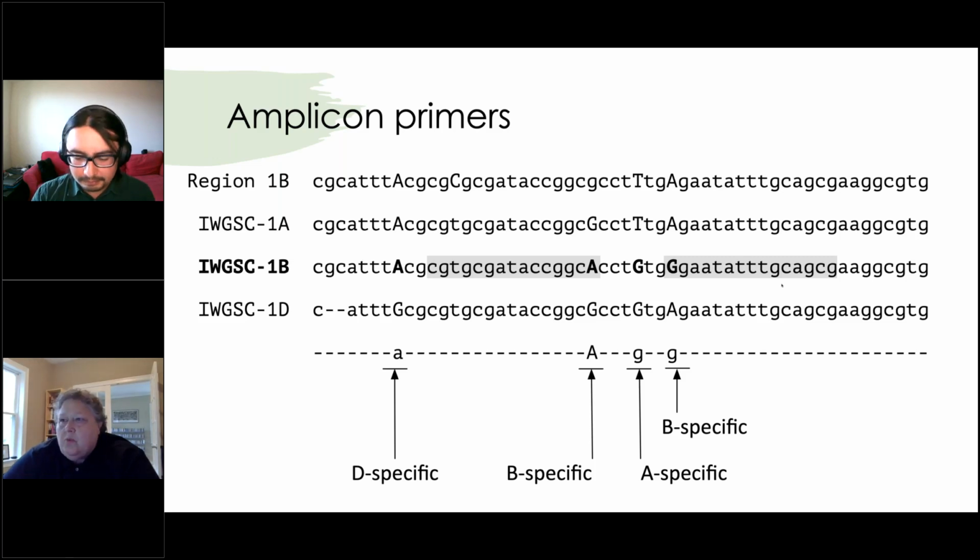Okay. So what's the error percentage for genome specificity of the primers designed with PolyMarker? That's a very good question. So in general, when we did this analysis, we had roughly 80 to 85% of the markers work as expected. But that was done with the old version of the assembly, from 2014. I haven't done a large scale experiment again to see how much it has improved, having a better reference.